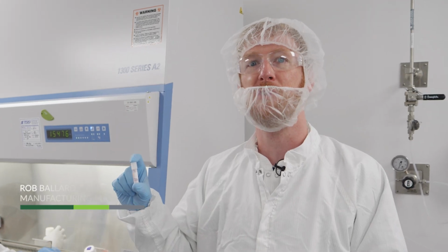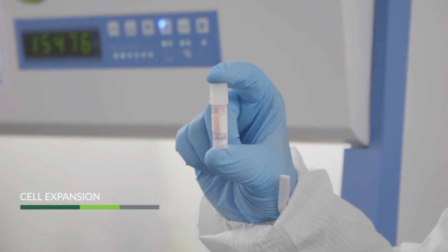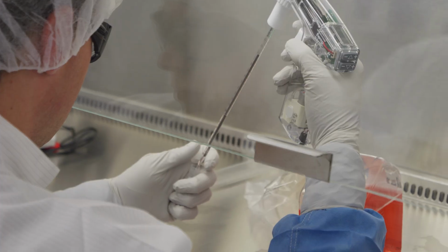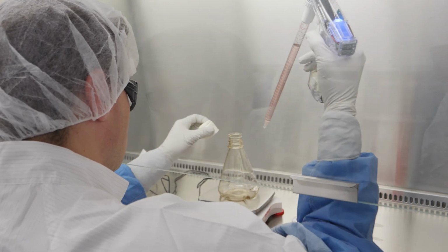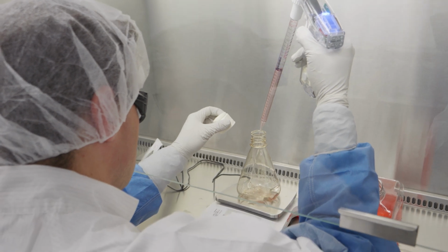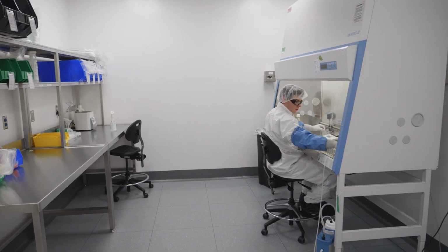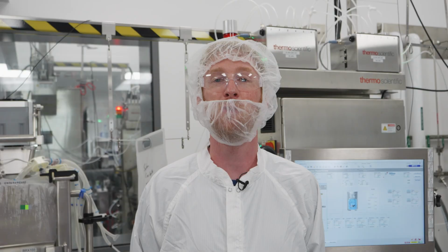The entire Kriya process begins with this humble cell vial. It has about 1 million cells that we will thaw in the biosafety cabinet, add to a shake flask with culture media, where it'll grow for a handful of days. Every few days we will come in and split it to a larger container with more media. This is us exponentially increasing our culture volume so that we're ready to take this out to the bioreactor to further expand the culture.